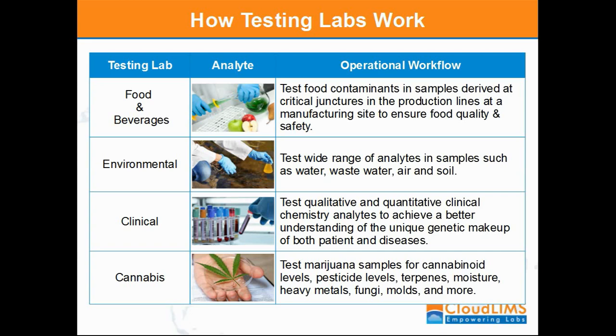If we size up the healthcare sector, we find several clinical labs and molecular diagnostic centers in a global competitive canvas striving to reduce cost and accelerate the delivery of high quality services.